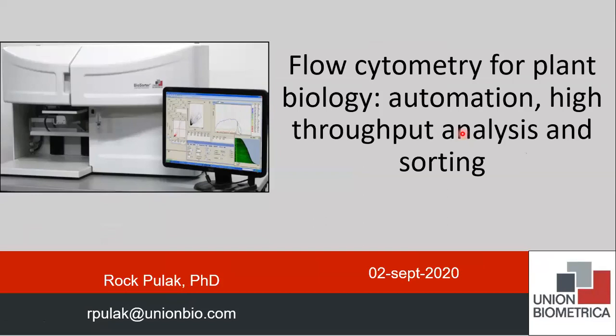And today I'm going to tell you about our flow cytometers and how they can be used in the plant biology field. So I've structured my presentation in two parts. First, I'll describe how our large particle flow cytometers work, pointing out some of the key features. And then I'm going to present some examples of applications using plant samples of various types, including pollen, seeds, protoplasts, and calli.